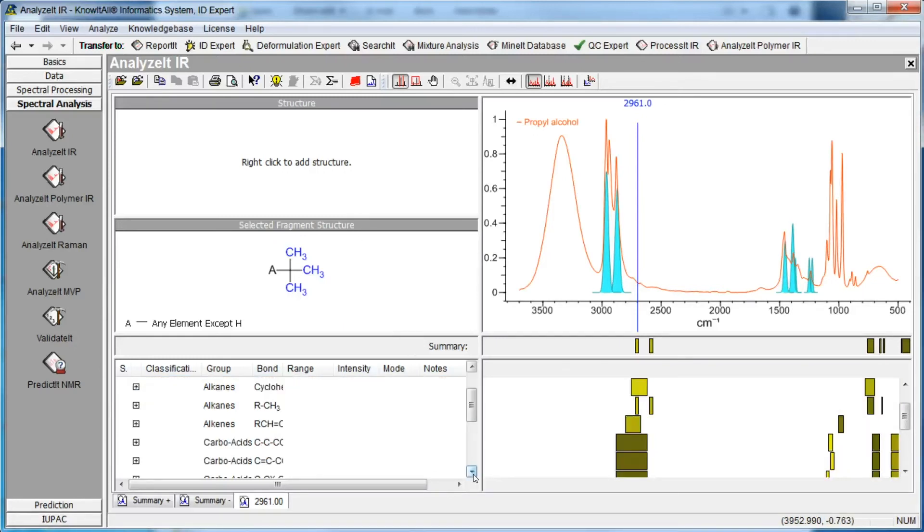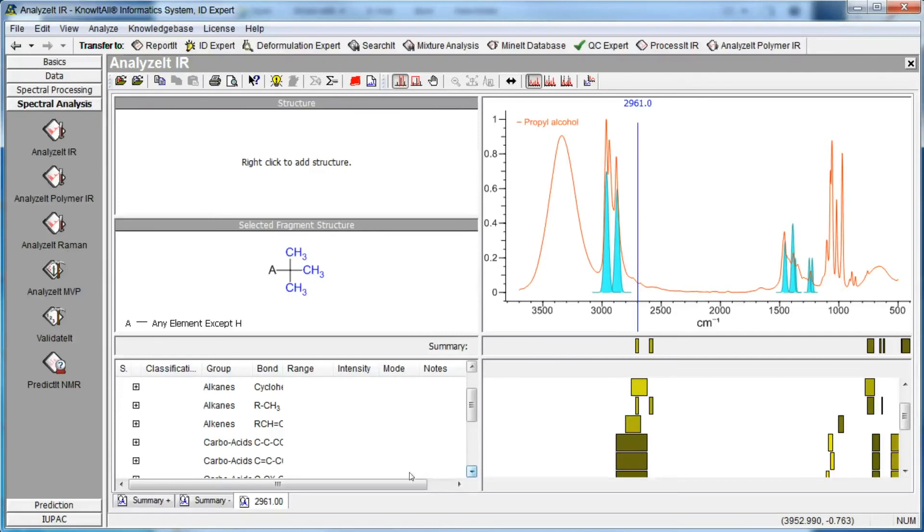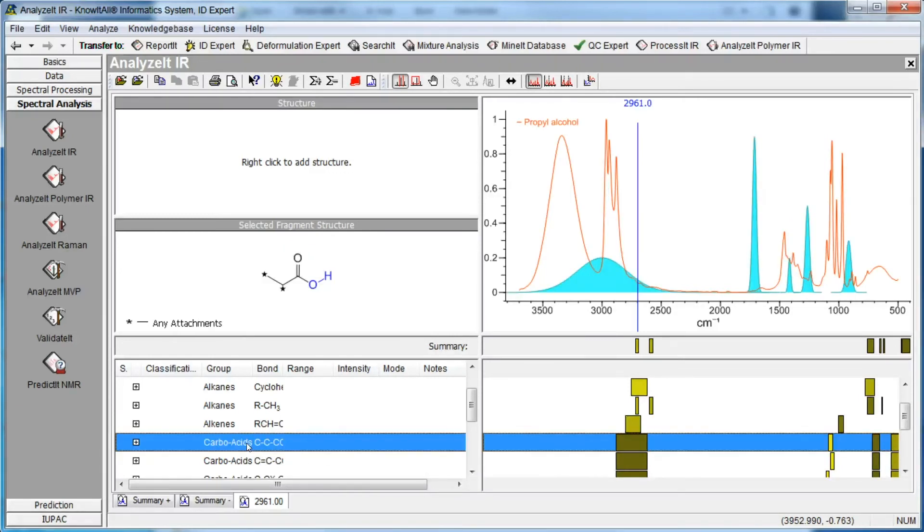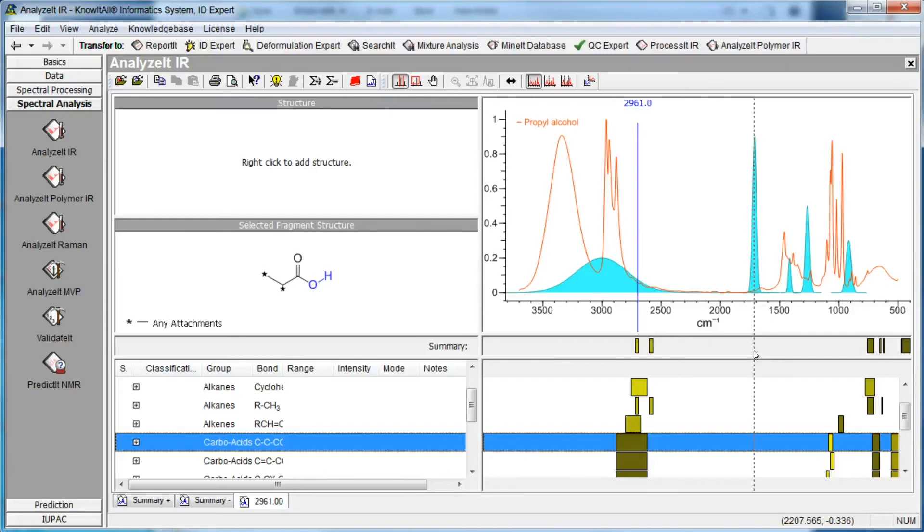The peak correlation results also include the carboxylic acid group because the broad OH band could occur in the 2961 region. However, the results indicate that there should also be a strong band near the 1740 region. Because our sample does not display this band, we will move this group to the Summary Minus tab.